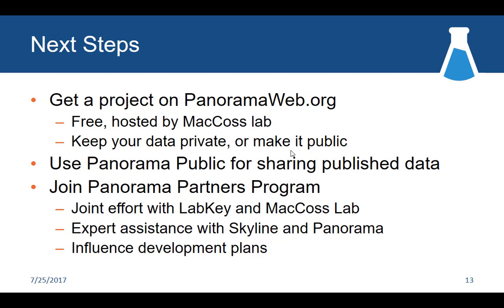getting it up and running, and then also making sure that people are making the best use of the software and its capabilities, and then even beyond that, helping us set priorities for what are the next things that we want to be adding to the software. Primarily on the Panorama side, but also very much integrated with Skyline, because Panorama does not stand on its own. All right, that brings me to the end of my time slot and slides.